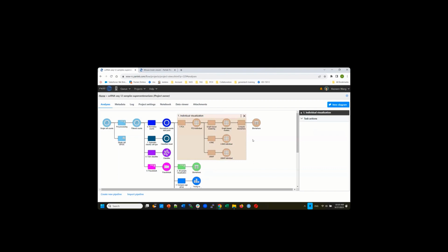However, I wouldn't recommend removing the batch right off the bat because, first of all, if there's no batch effect, any batch remover is going to change your data, and you can get closer to the truth or you might get further from the truth. You don't know.